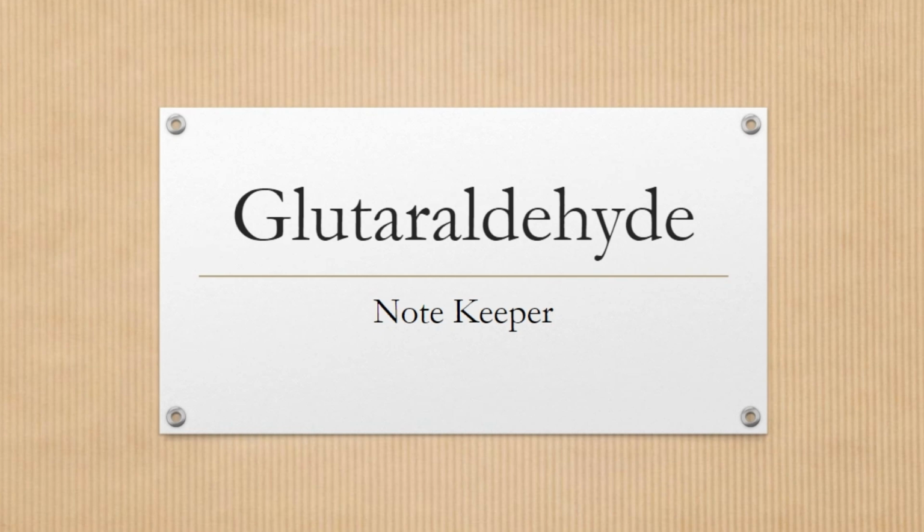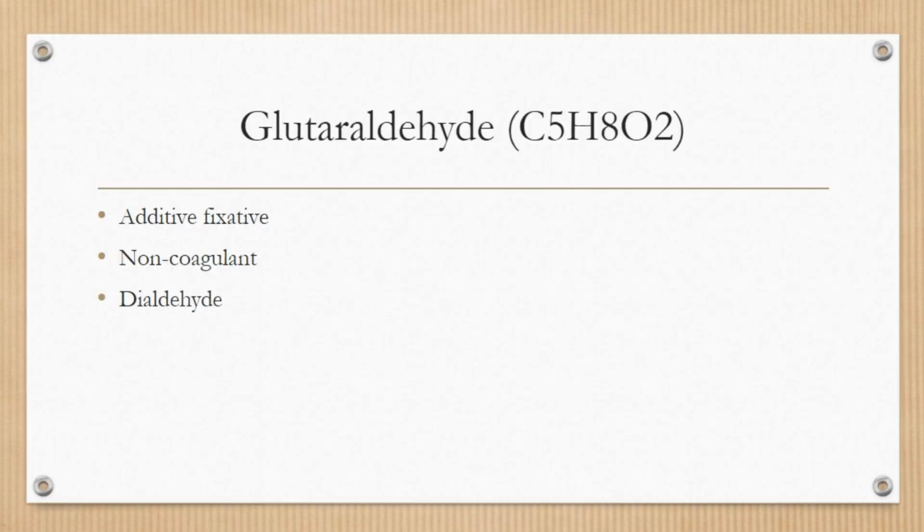Glutaraldehyde is a fixative used in histological procedures. Glutaraldehyde is an additive fixative, meaning it combines with the tissue and part or all of the fixative becomes part of the tissue. It is a non-coagulant, indicating it forms extensive cross-links, producing a gel with low permeability. This is common with additive fixatives.